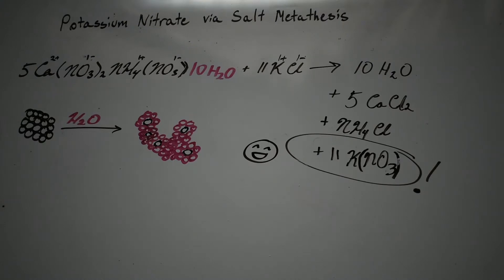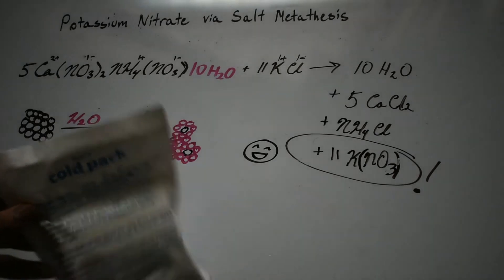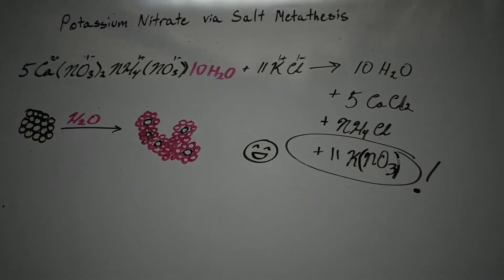Welcome to the lab. Today I'm going to make some potassium nitrate using calcium ammonium nitrate cold packs and some potassium chloride I have in the lab. Potassium nitrate has a few commercial uses - one being stump remover - but I couldn't find it anywhere near me, so I found this calcium ammonium nitrate decahydrate instead.